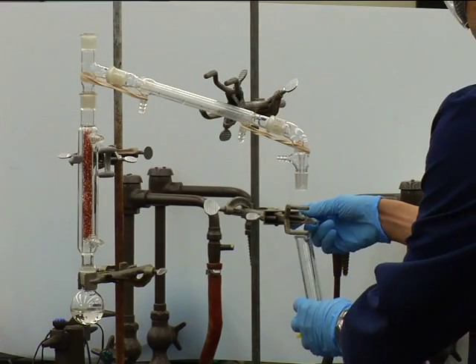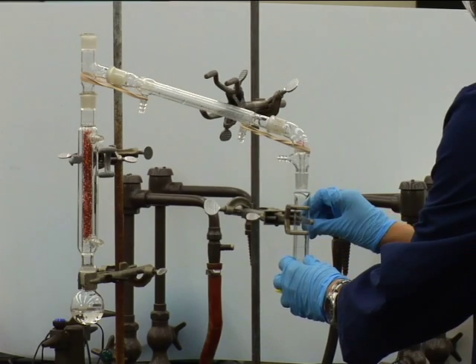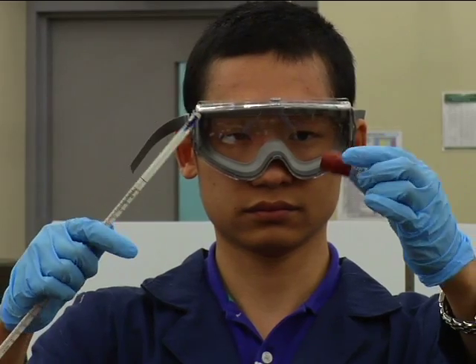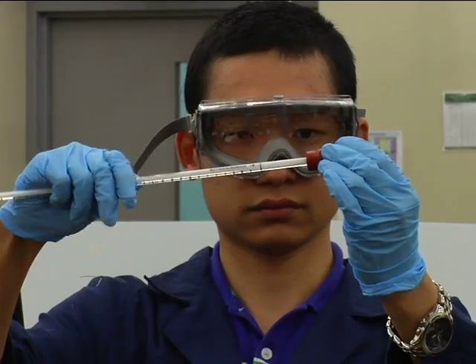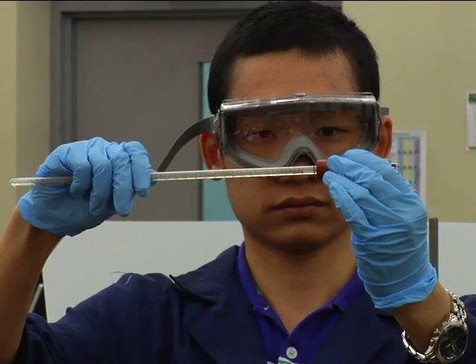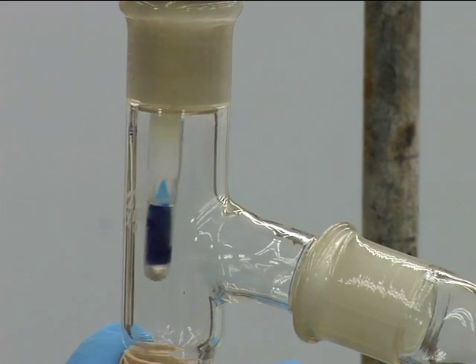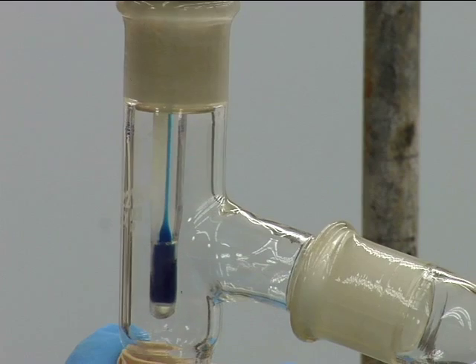Mount the 10-milliliter graduated cylinder receiver using a small three-finger clamp. Insert the thermometer carefully into the adapter — grasp, twist, and gently push. If it does not go into the adapter easily, moisten the glass. Mount the thermometer on the still head. Adjust the height of the thermometer so that the top of the mercury bulb is a little below the sidearm.